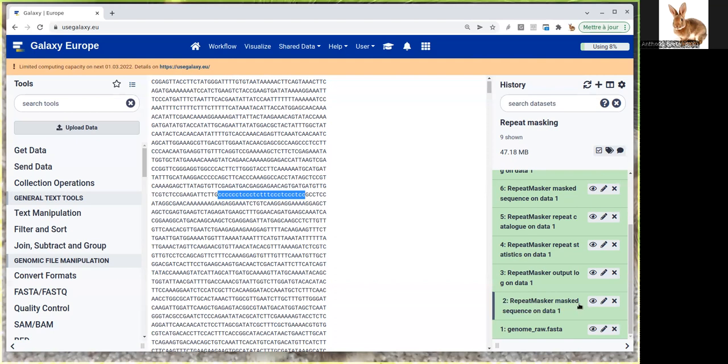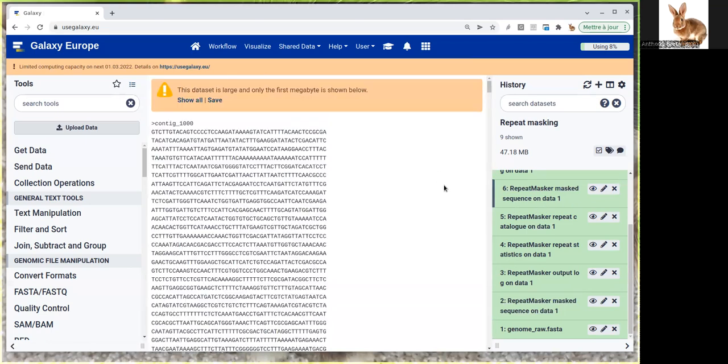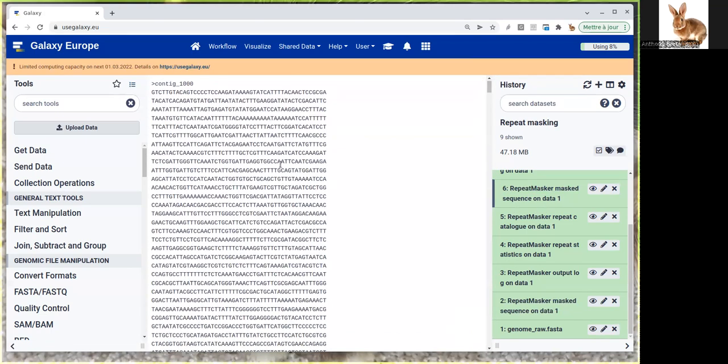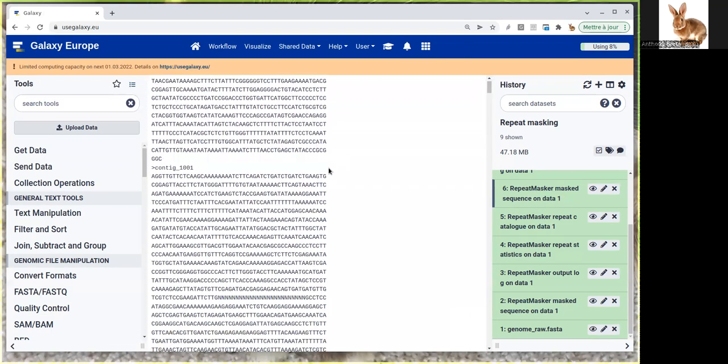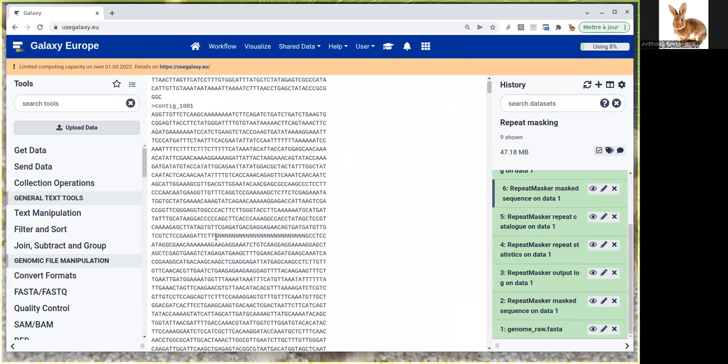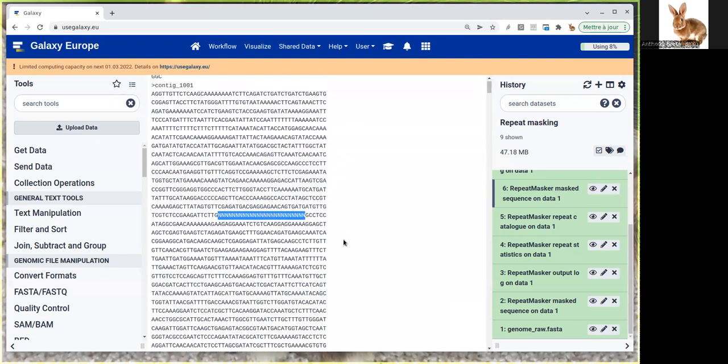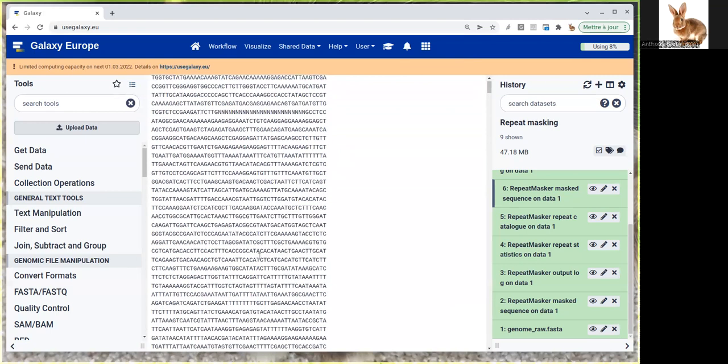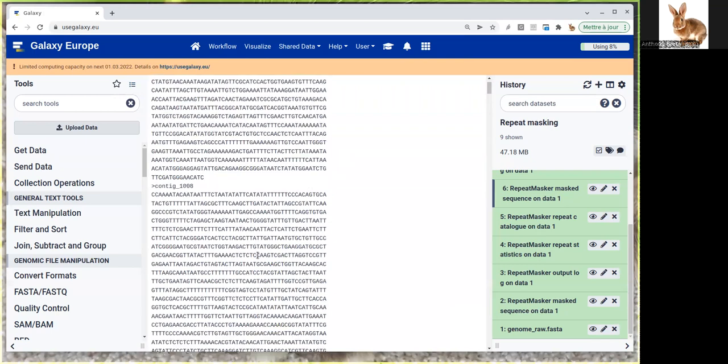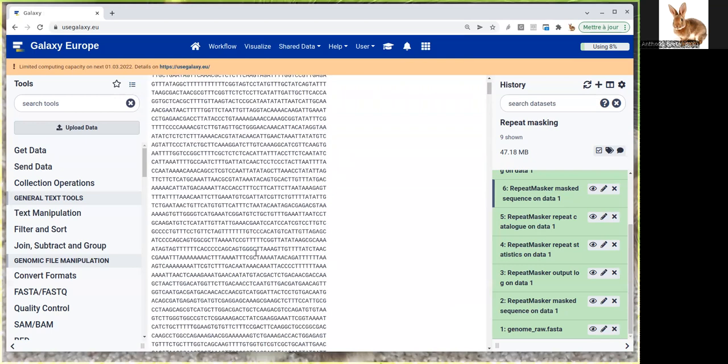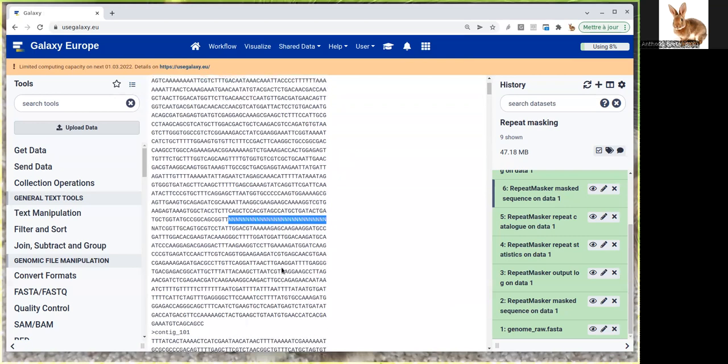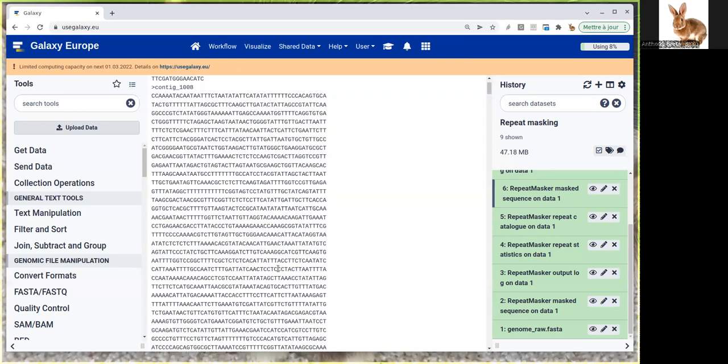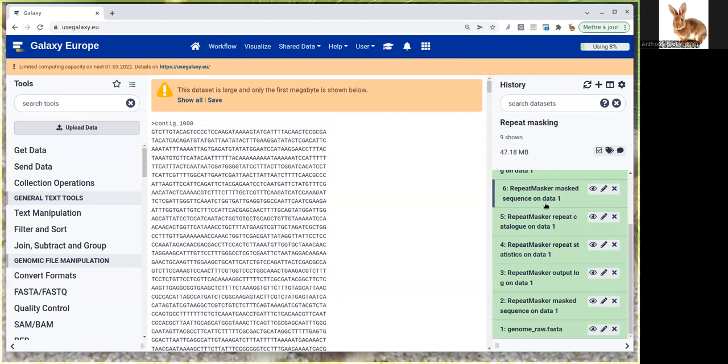If you look at the same output for hard masking, dataset number six, you'll see the beginning is the same. But for all the repeated sequences, instead of having the sequence in lowercase, the whole sequence is replaced by Ns—the exact same number of Ns as the length of the repeated sequence. You get these everywhere there's a repeated section. These are exactly the same regions as in soft masking, just written differently in the output FASTA file.